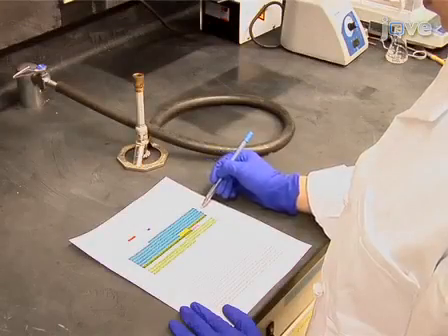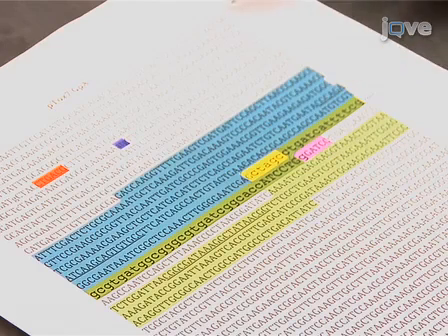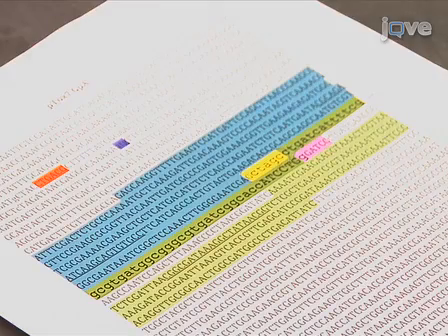Prior to the start of this protocol, pTox7 plasmids expressing the required chimeric protein are prepared from commercially synthesized oligonucleotides representing the TMDs of interest flanked by NheI and BamHI restriction sites.